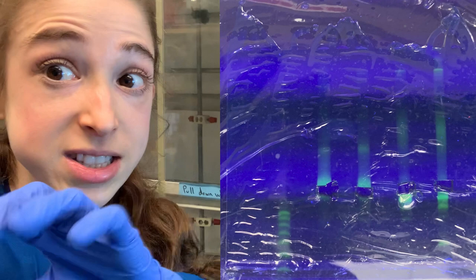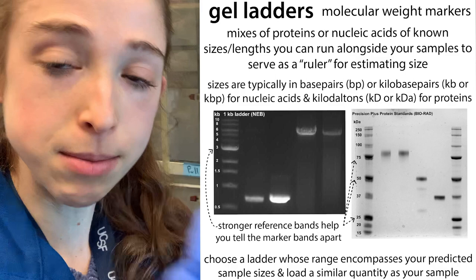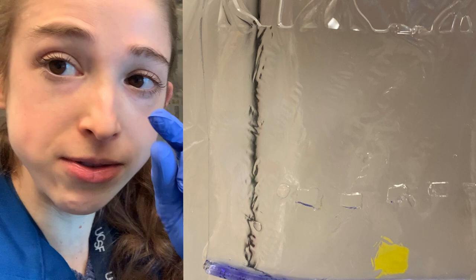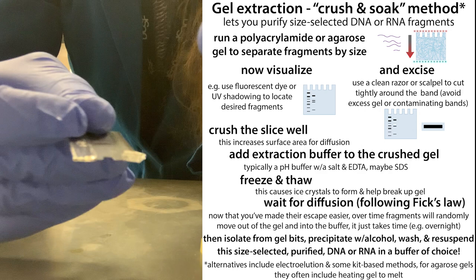Ideally, have lanes spaced out between all of them. Make sure you have a ladder or size marker if you're trying to cut out something of a specific size — for example, a control product of known size — and then cut out the bands that match. Again, cut right around the edges to minimize the amount of gel, which reduces the work needed to then get rid of all that gel material.